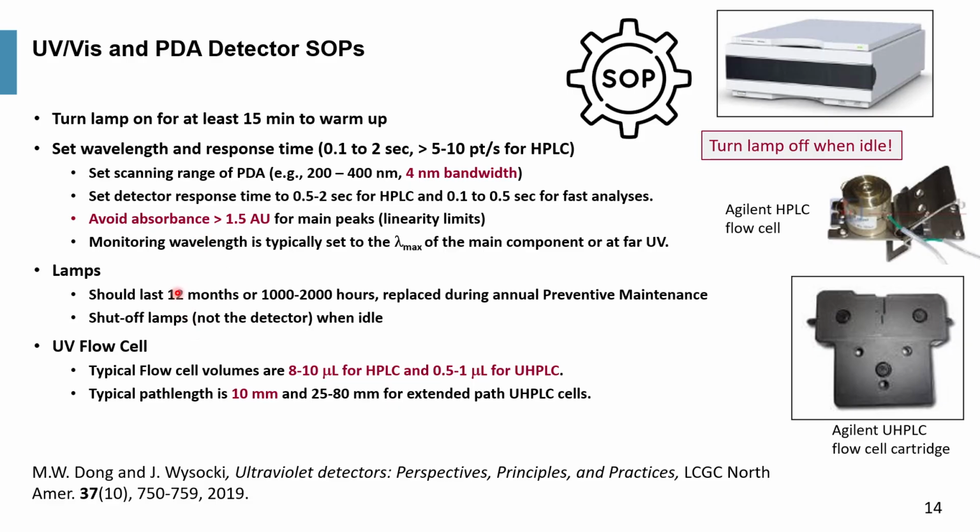Typically, we would set the monitoring wavelength to the lambda max of the main component or the API for pharmaceutical analysis. If it does not work, the next preference is in the far UV, perhaps around 210 to 230 nanometer.